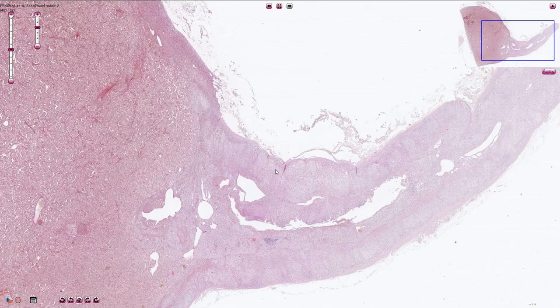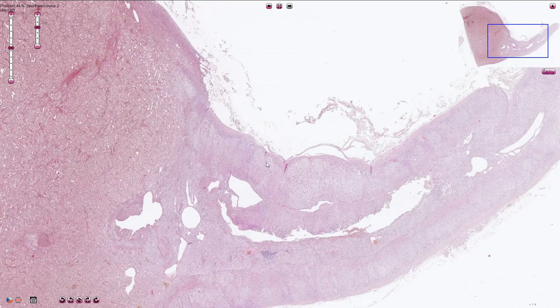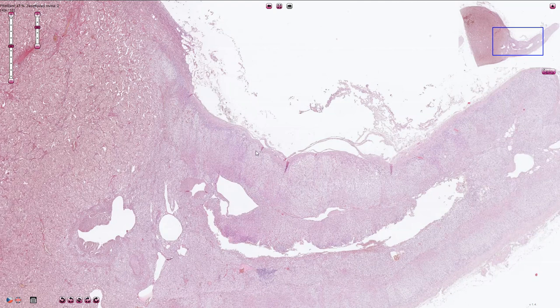Here we can see the cortex with a fibrous capsule, and beneath the capsule there is a zona glomerulosa, zona fasciculata, and zona reticularis.